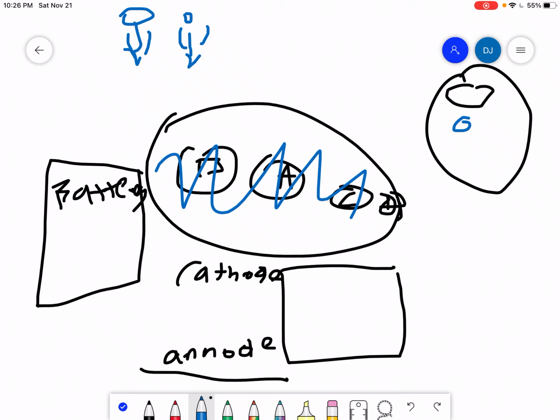So we can use this same analogy to say that the larger fragments are going to move slower toward the anode side than the smaller fragments. The smaller fragments will move through the gel more quickly simply because of their physical size. They can move through the pores much more easily.